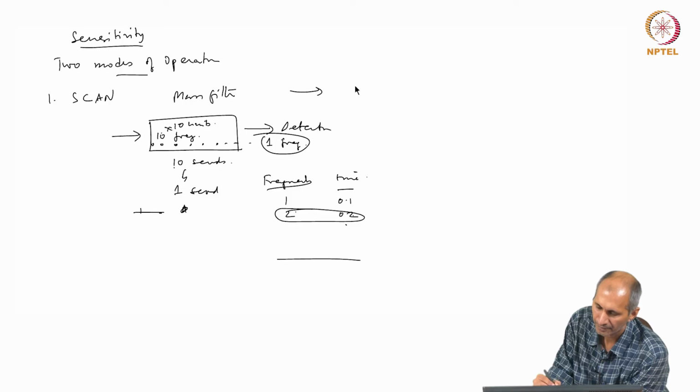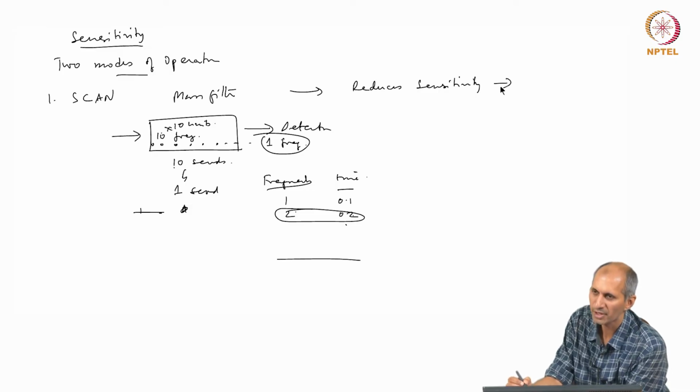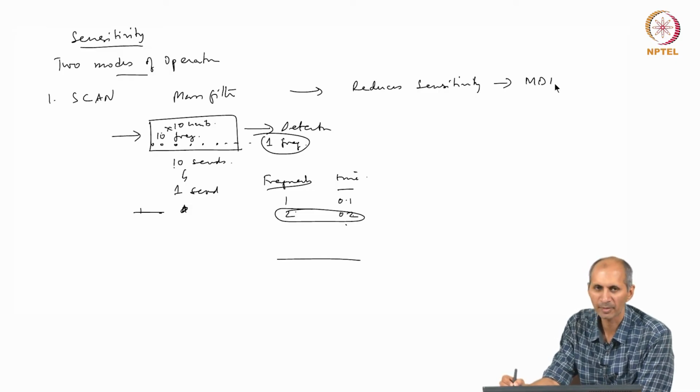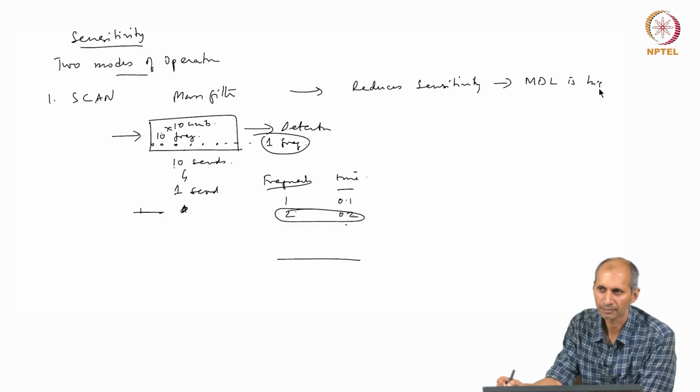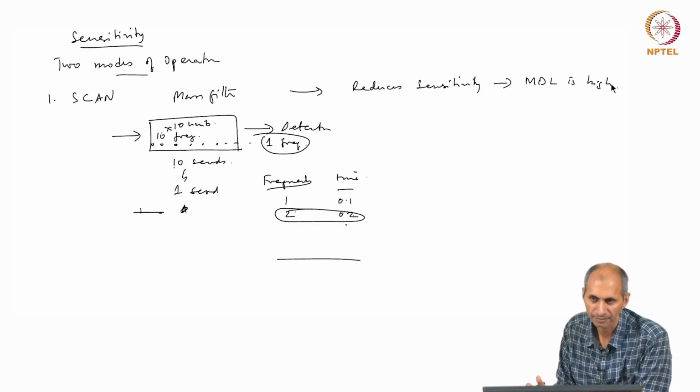Scan, which means that my minimum detection limit is high. I need higher concentration to detect it. Okay.